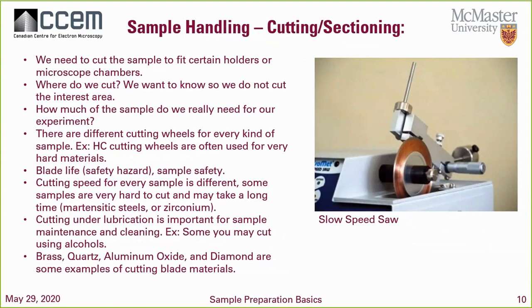What's the area of interest that you want to cut? You don't want to cut right across that grain boundary that you want to look at. How much of the sample do we really need for our experiment? We don't want to use it all. We can tell the customer, hey, you can just send me this much.